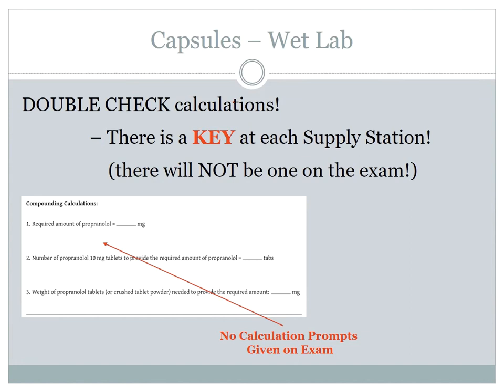So you will need the weight of those 7 tablets. A tablet, though, does not have a shell. So is the weight of a tablet the same as the weight of a tablet once it's crushed up into powder? Yes, it's the same weight. So you do not need to crush up the propranolol tablets. Just weigh the number of tablets, whatever that tablet is that you need. The weight of them as tablets is the same weight as it is as a powder. And it's more accurate to just leave it as the tablets. Okay, so you will just calculate and weigh the X number of tablets.